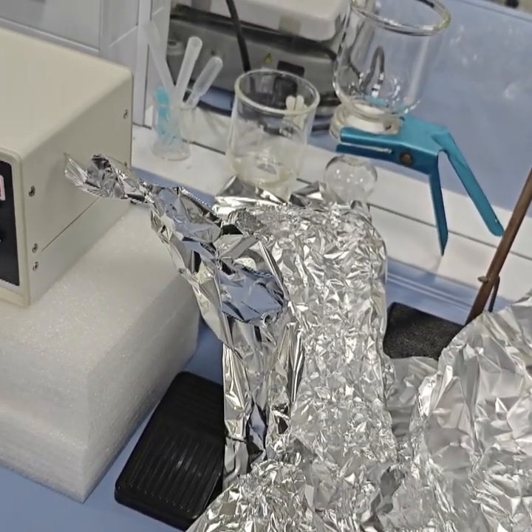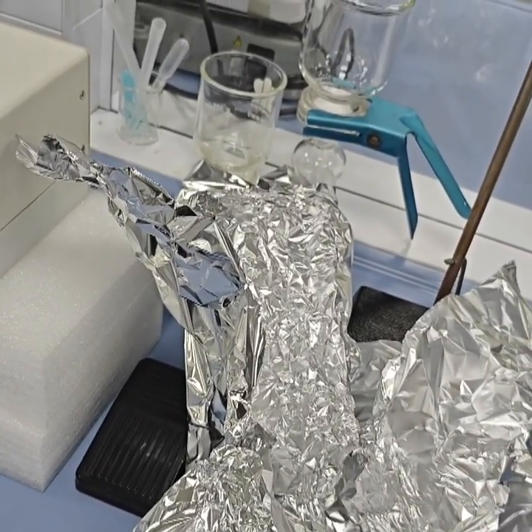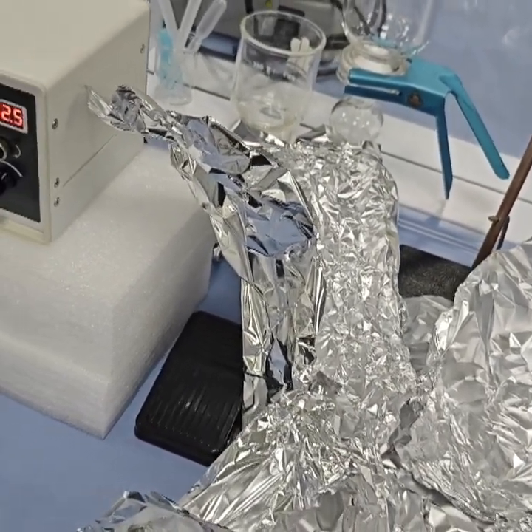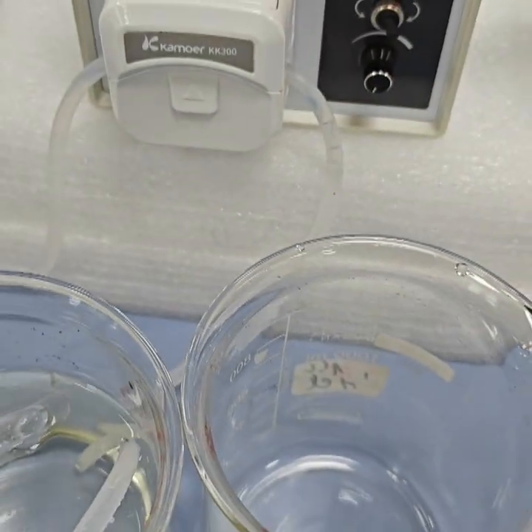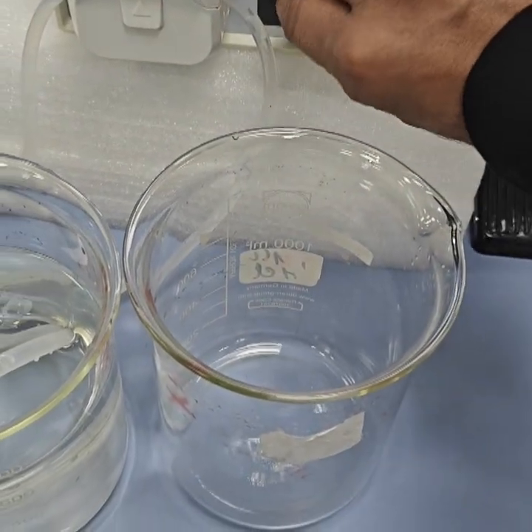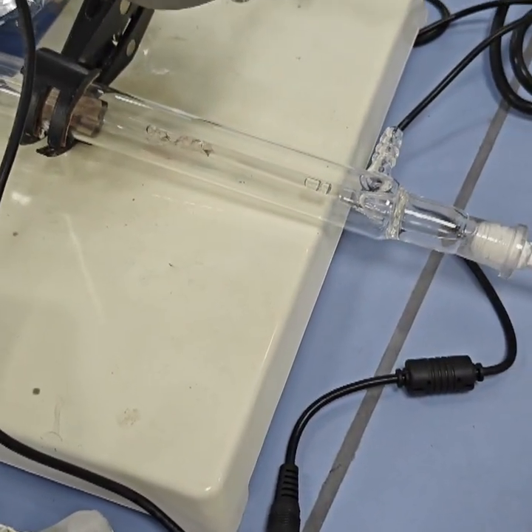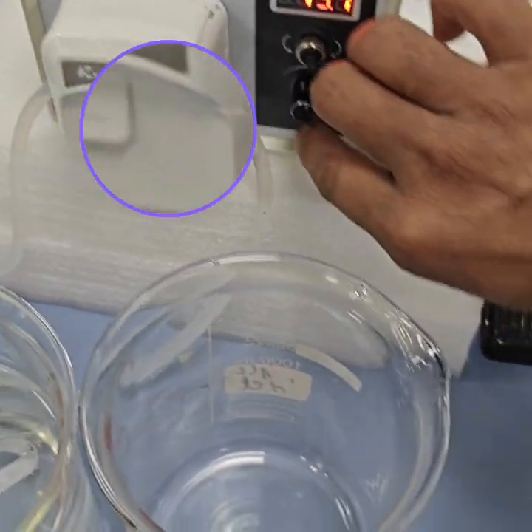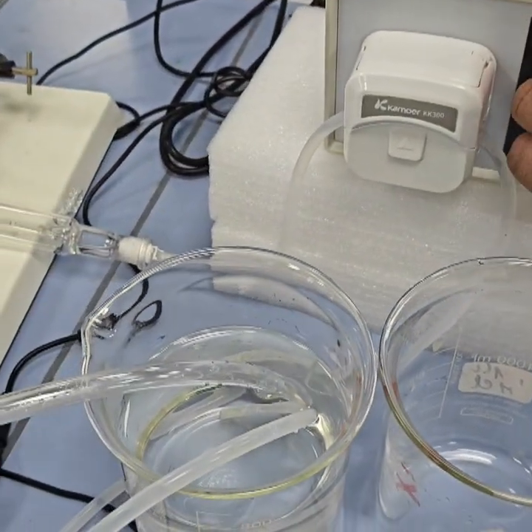So it could be called a continuous flow water treatment system using a peristaltic pump, or the design and operation of a continuous flow reactor for wastewater treatment. Now to start, we have to start the pump and continuously pass the water through here. You can see the water is slowly passing, and if I increase the flow, the water will pass here also. This is how the continuous flow reactor system works.